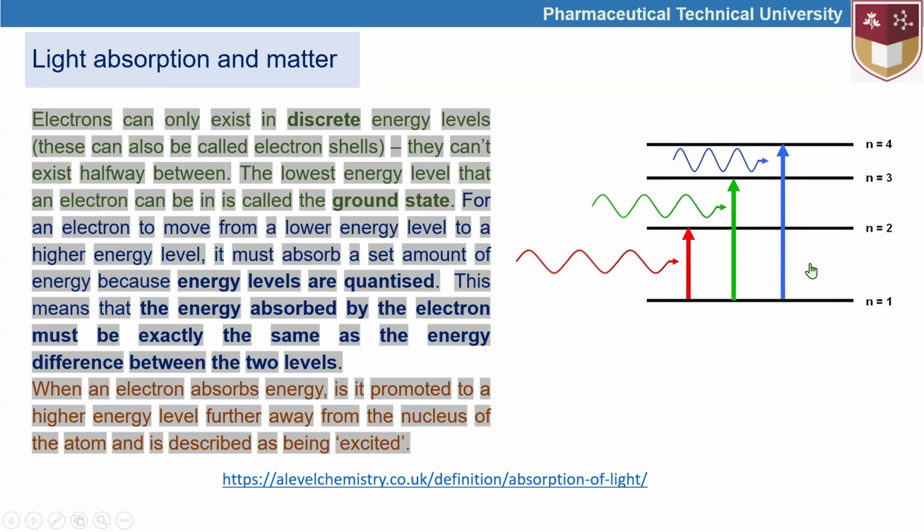Here we can see that this line can be understood as the ground state, and based on the photon energy of the electromagnetic waves, including different colors, the jumping state of electrons might differ.